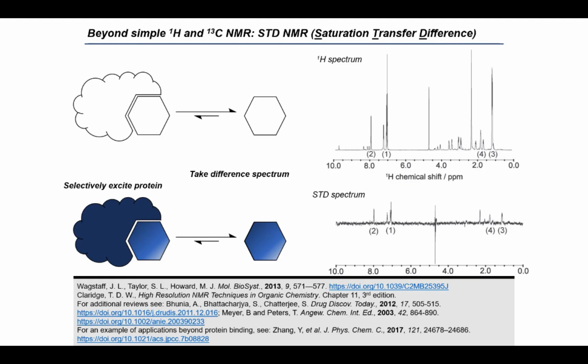And so this can be a really important tool for understanding how molecules are binding into biological systems, although this of course is not the only application for STD NMR.